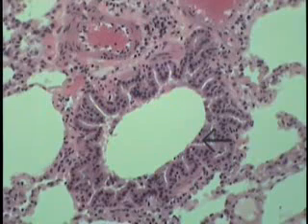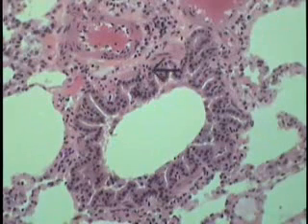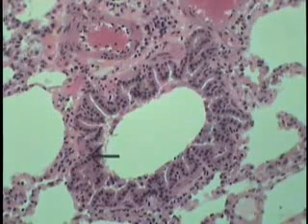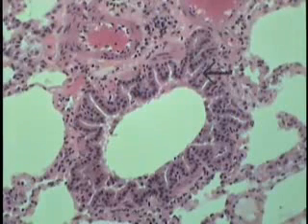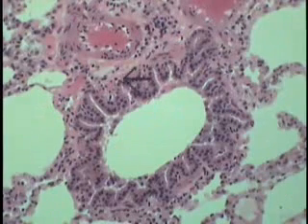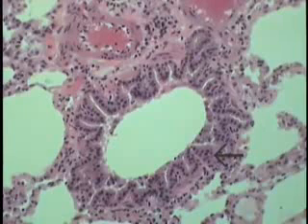This particular field represents a typical bronchiole cut in cross section. Its characteristic feature is the scalloped or folded nature of the lining epithelium. This is perhaps due to the contraction of its major component of the supporting wall, that is this bronchial smooth muscle, that's seen cut a little bit lengthwise in cross section and usually courses all the way around the outer circumference and forms the supporting wall to this small tube.